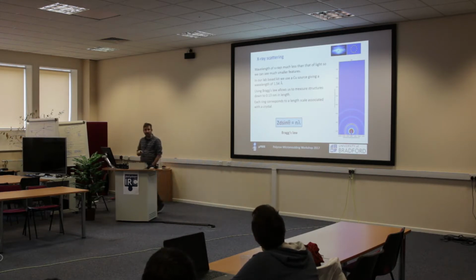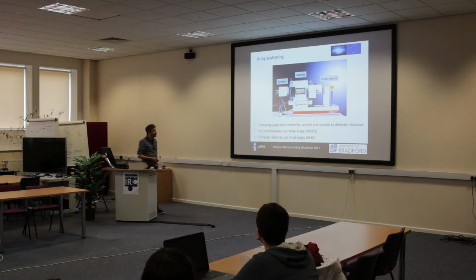Now you don't just see the crystals, you can see how crystals stack. You can see how clays align. You can use this technique for a huge range of different length scale determination. And this is all it does. You have an X-ray source here.